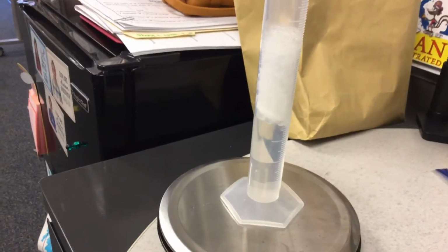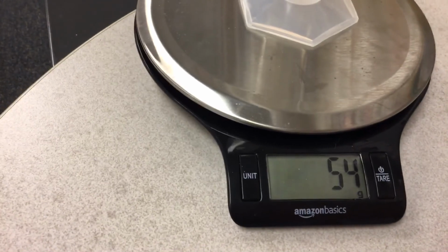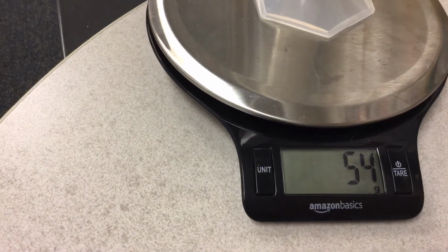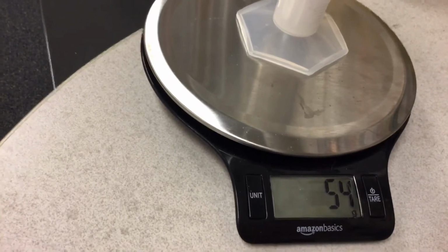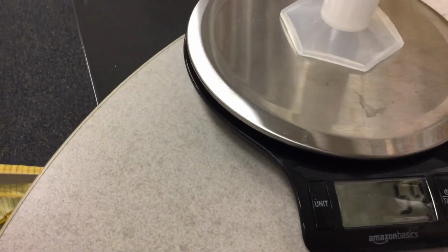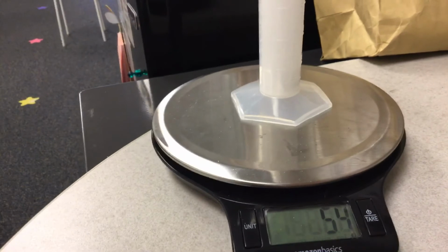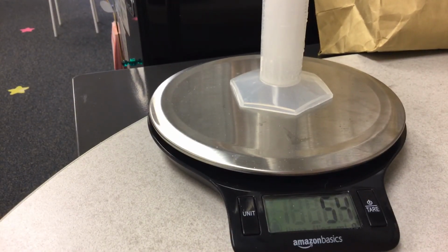Take a look. I mean, you guys know it's bubbling. You guys can kind of see it. It's letting off that carbon dioxide. But let's take a look at what's going to happen to the mass. So it's still bubbling. Look what happened to the mass, guys.